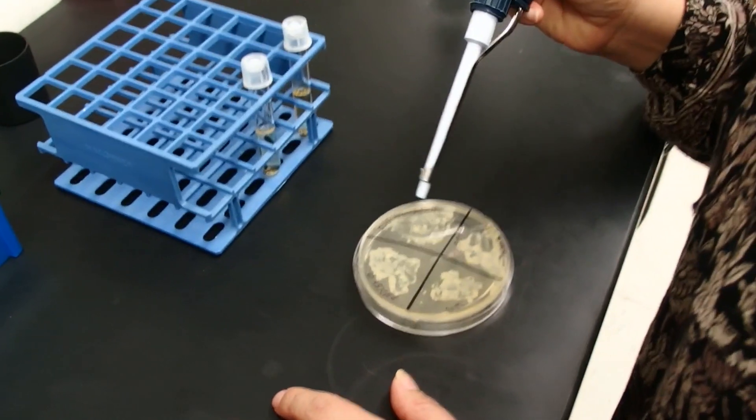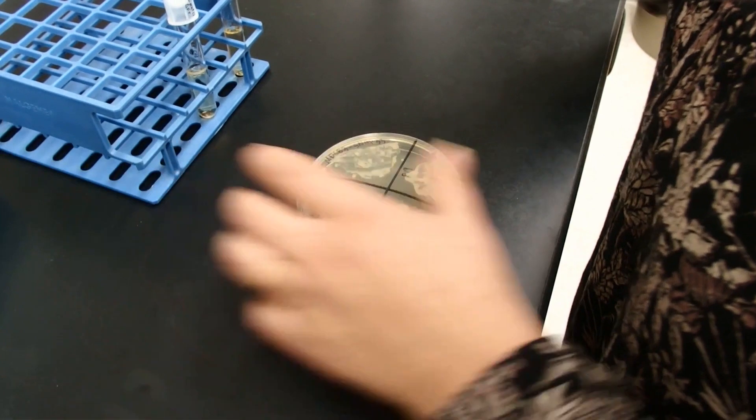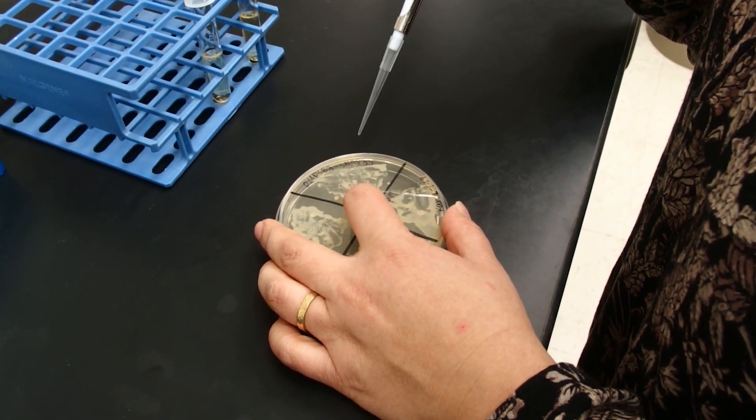I'm going to start by inoculating this tube, starting with the bacteria that contains my gene of interest.